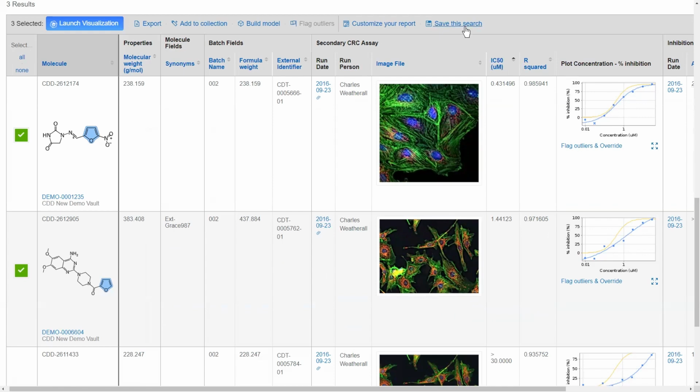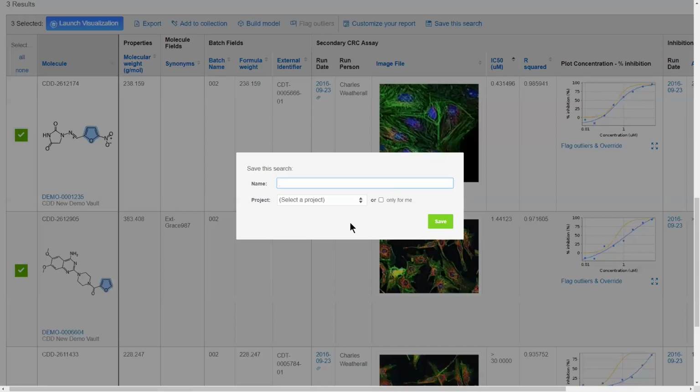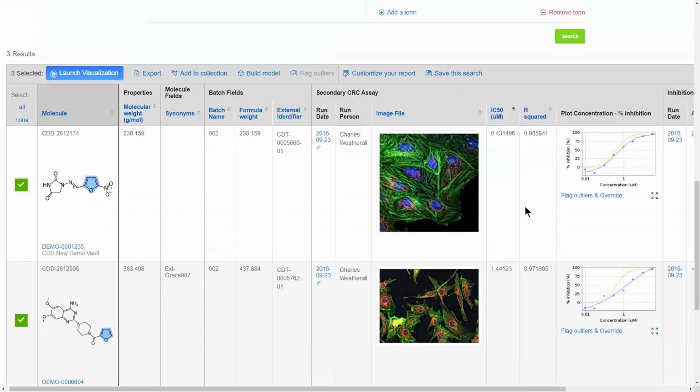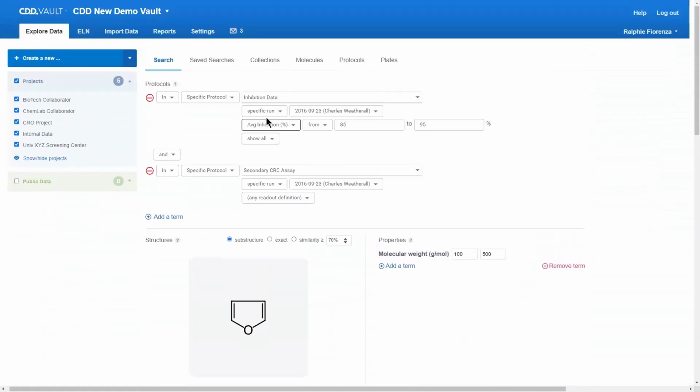These reports can actually be saved, so you can save these customized dashboards, either sharing them with everybody in your project or keeping them for yourself. And the idea behind a saved search is we are actually saving the table layout and the query for you to continuously run over and over again and see new hits based on certain activity thresholds.